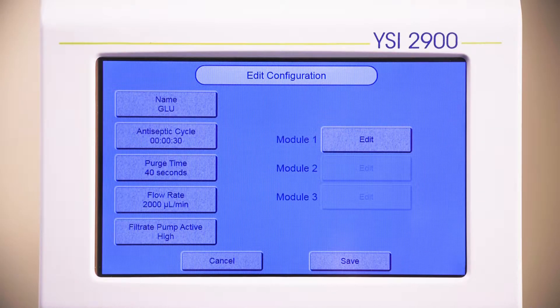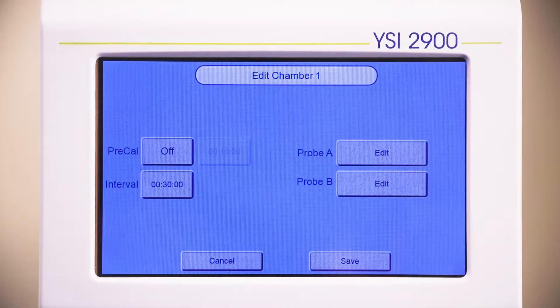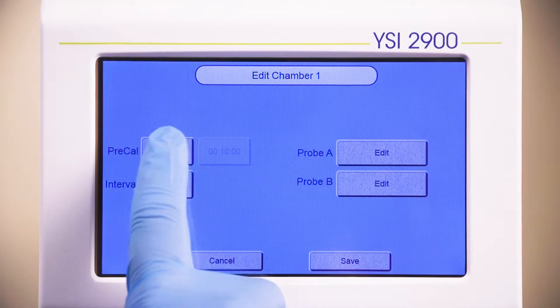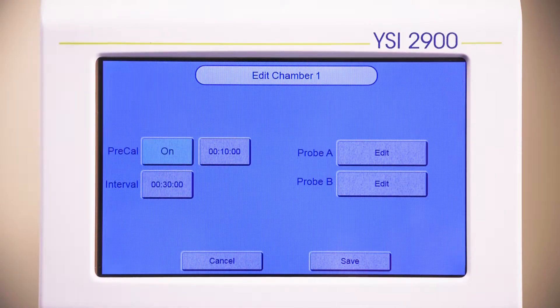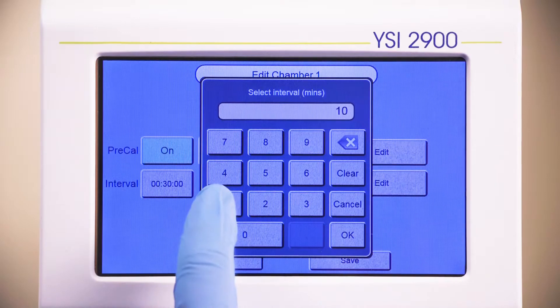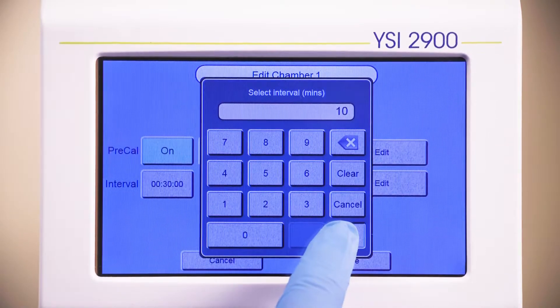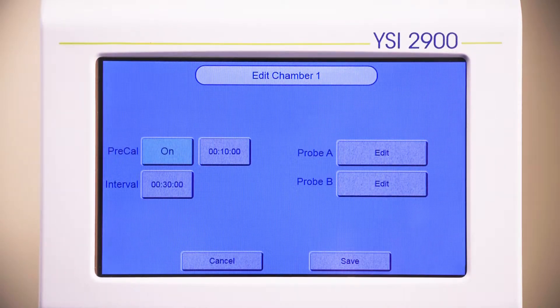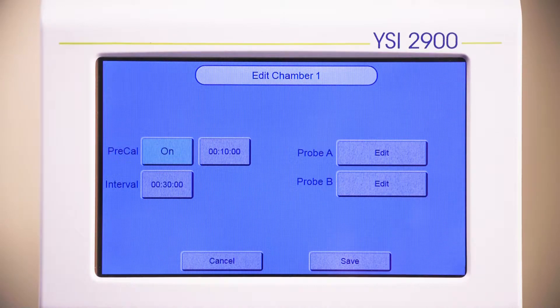Next, select the module. We'll select Module 1. If you would like the instrument to calibrate before each scheduled measurement, press the button next to the Pre-Cal settings to turn it on and select Pre-Cal time in minutes. The default setting is 10 minutes, meaning the instrument will calibrate 10 minutes before each scheduled sample.